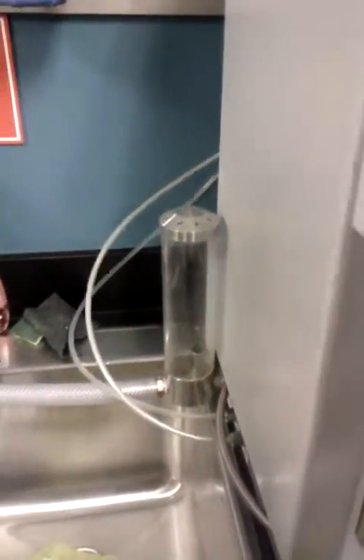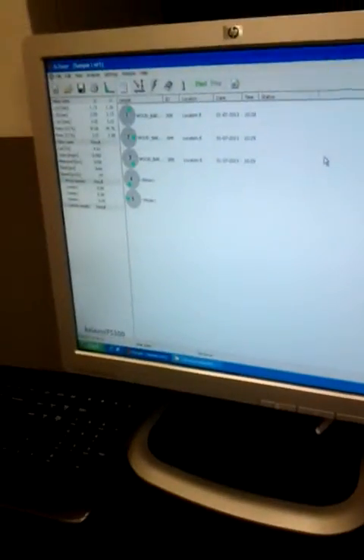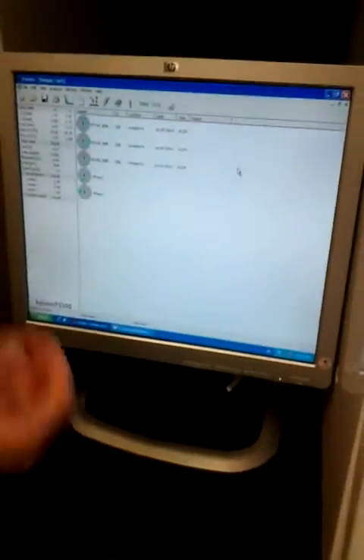So this machine doesn't need to be filled with water. It's going automatically. This is the air pressure, and this is the water. It takes the water and then it eliminates the water. So it's automatic, connected to the pipes. Because of that, you can use tap water because it has a filter there. You use just the water, not the impurities.